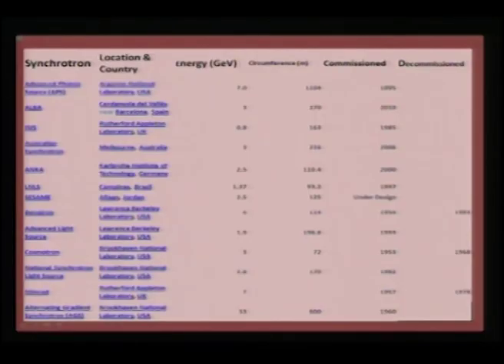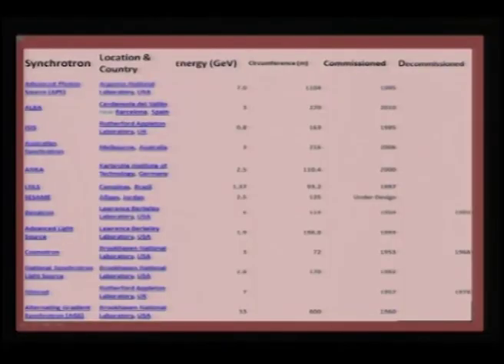Having seen the sophistication involved in this, I should also mention to you that this is a very selective facility available across the world, and here is a list of all the synchrotron radiation facilities that are available. It is also called the advanced light source, and as you would see here, many countries are competing in this field.